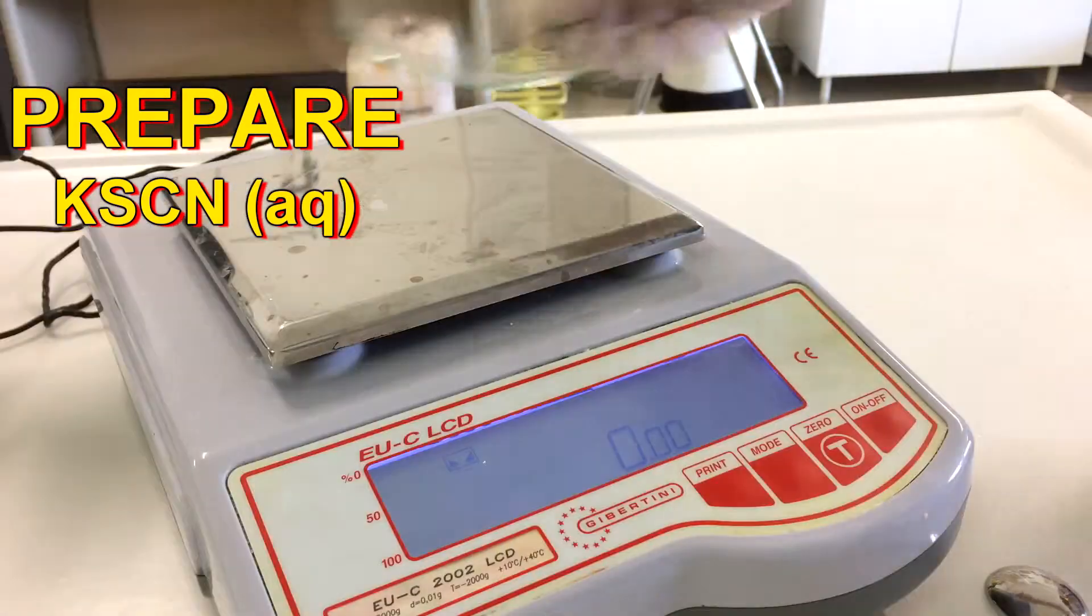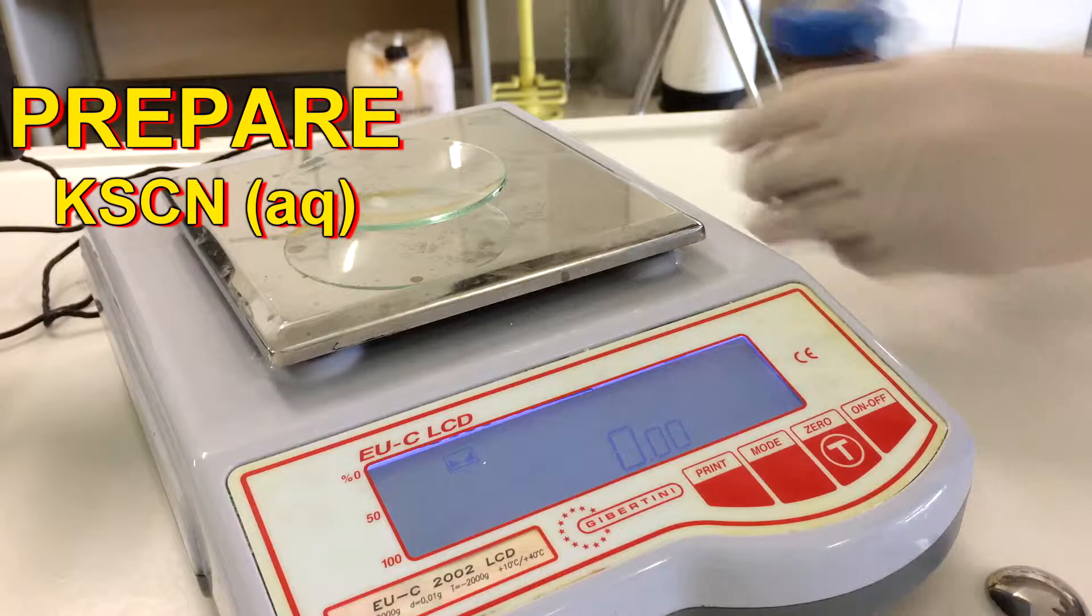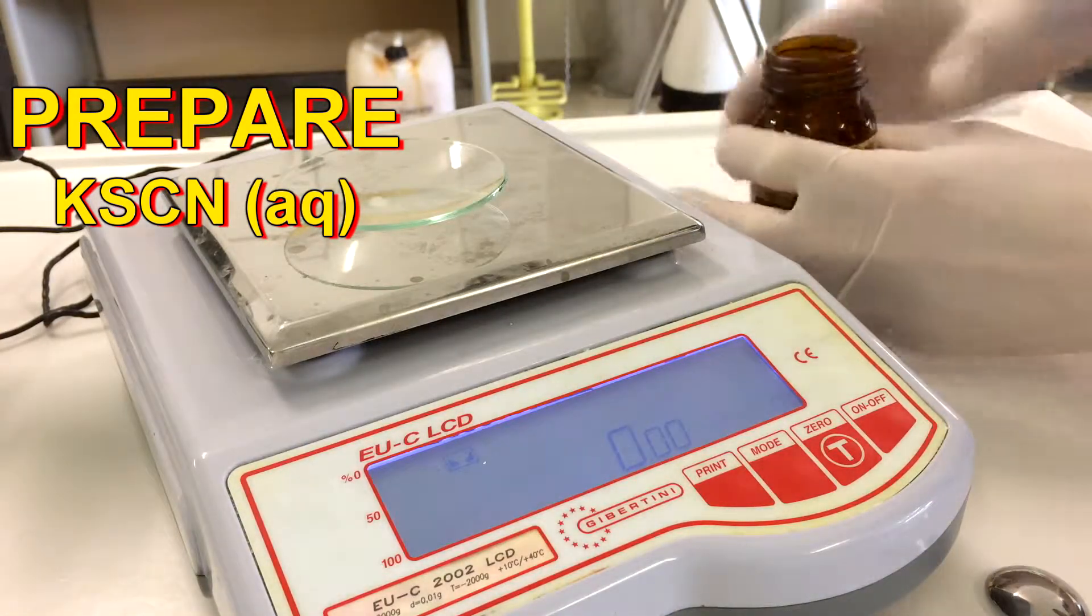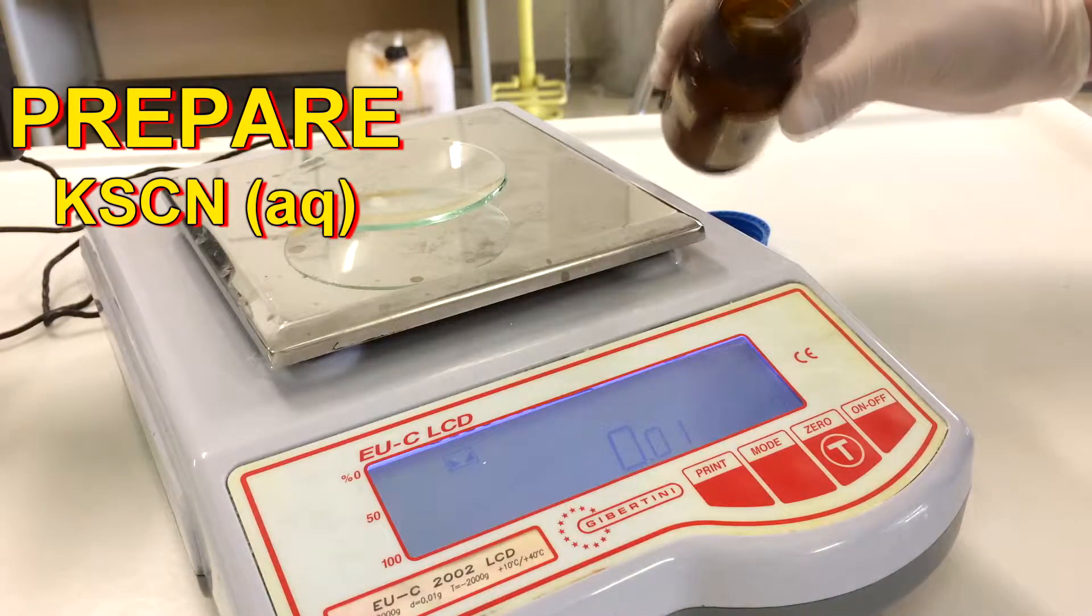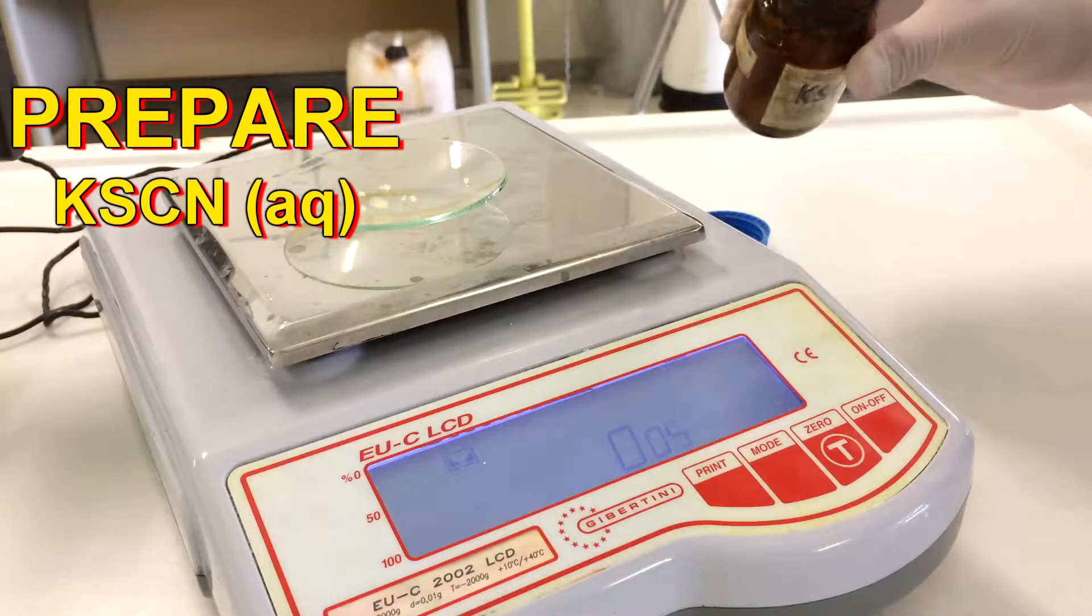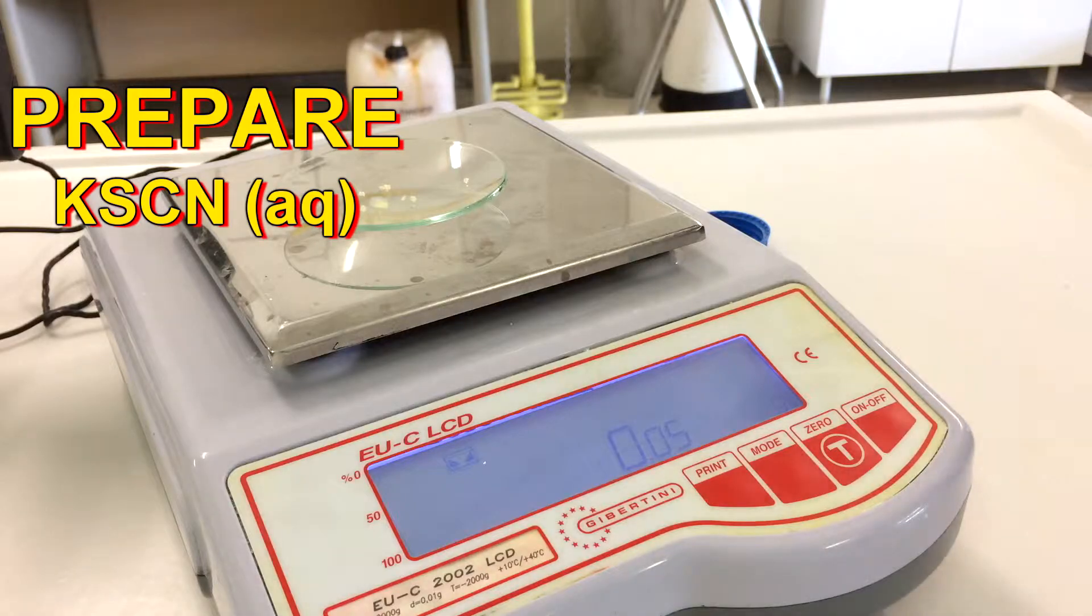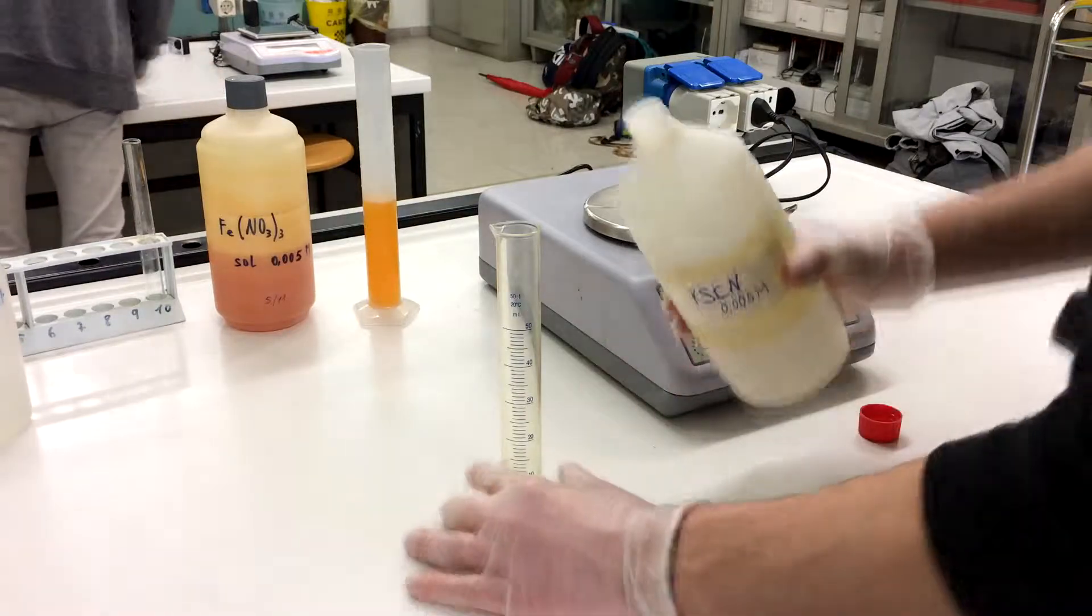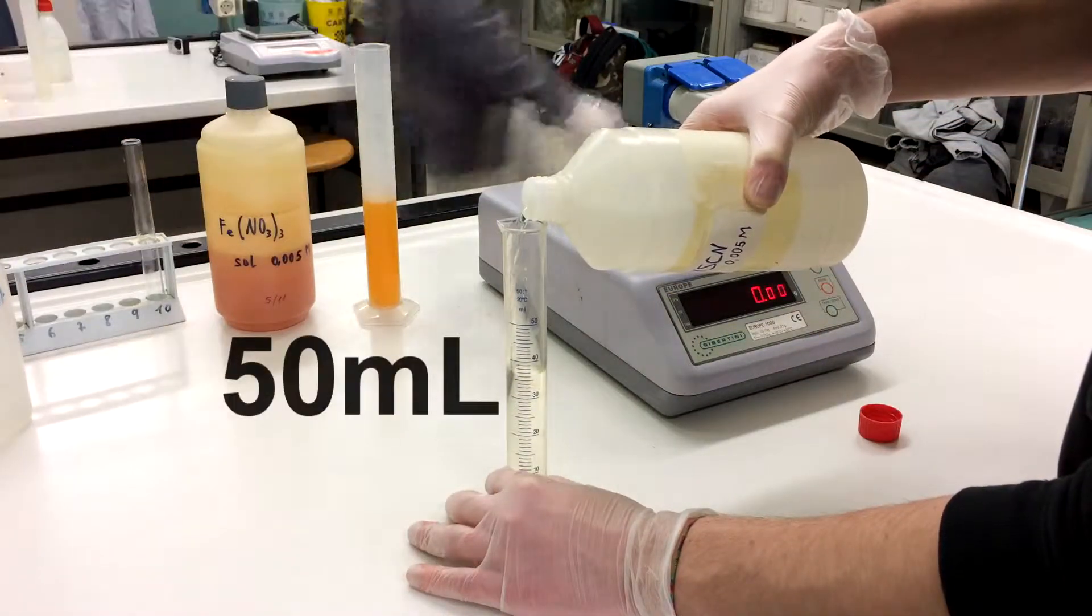After we weigh 0.05 grams of potassium thiocyanate, we pour 50 milliliters into the 50 milliliters graduated cylinder. Then we create the solution of 100 milliliters and pour 50 milliliters into the 50 milliliters graduated cylinder.